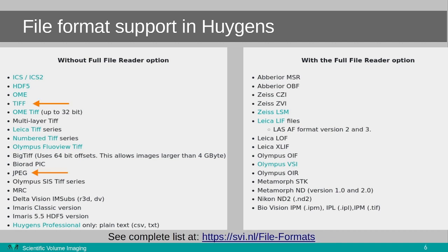Many of you are probably familiar with 2D image formats such as TIFFs or JPEGs, which are often still used to save images from, say, your smartphone camera, and these are also widely used online. They can also have a place in microscopy if used properly. But what makes these microscope file formats different from the JPEGs that your smartphone makes?